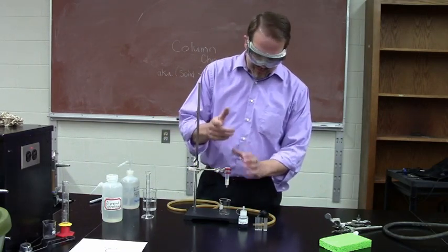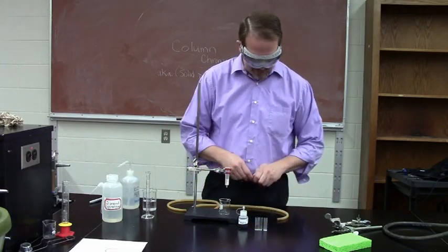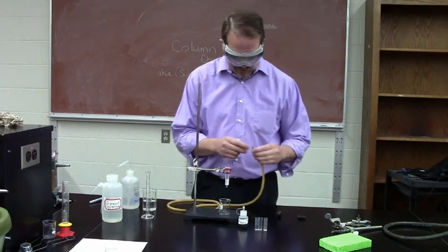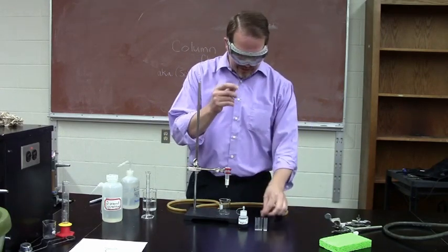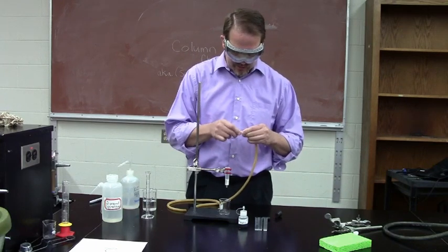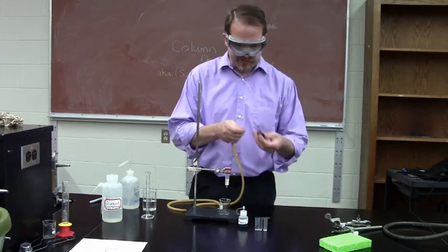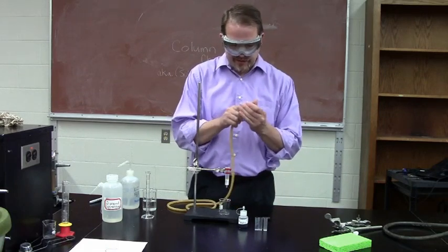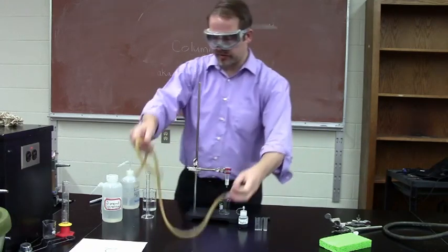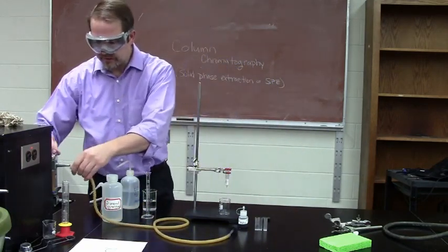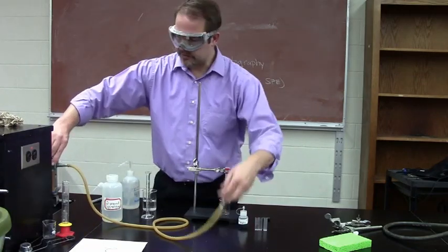Now the lab talks about using a thimble, or a plunger, or something to push that through. In graduate school, I was exposed to a different technology of using a little bit of air pressure. So if you take your medicine dropper, take the top off, we're going to hook it to your hose, and we're going to make, and if you can find a number four stopper, or a number three, or a number five, it'll all work. We are going to hook this up to air pressure.